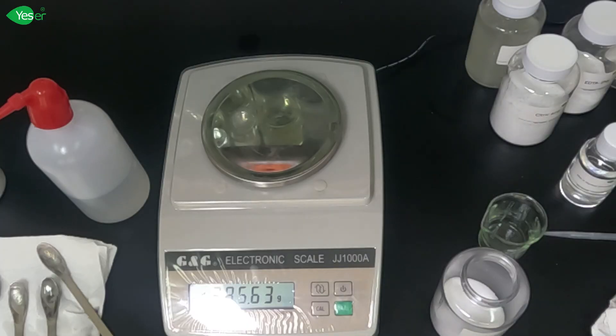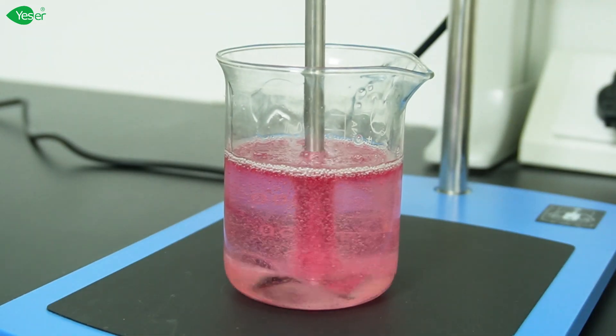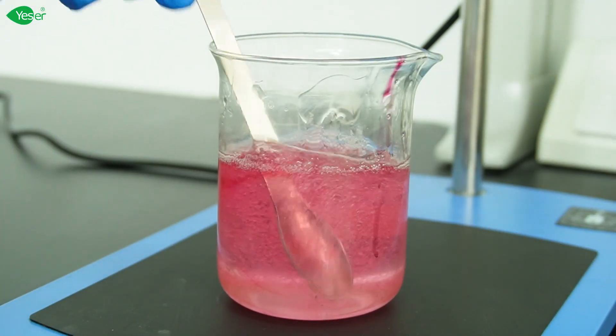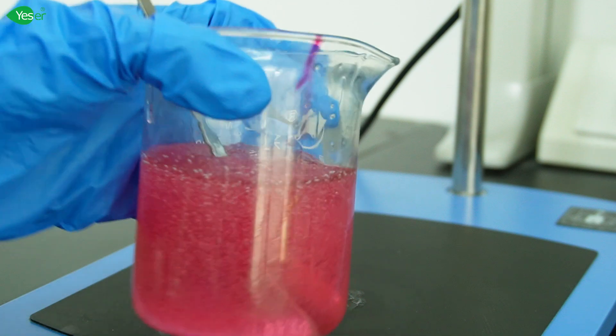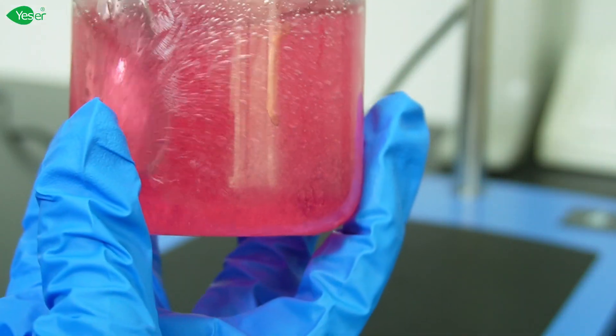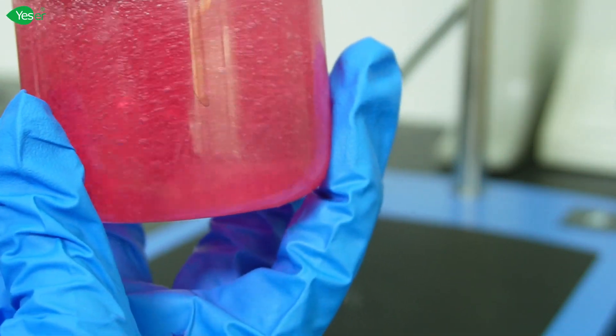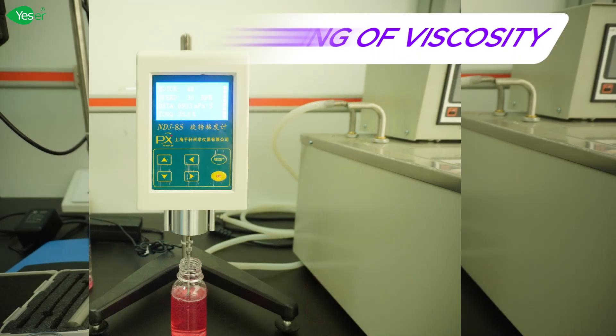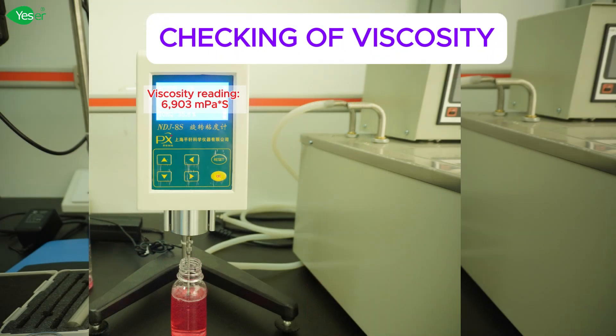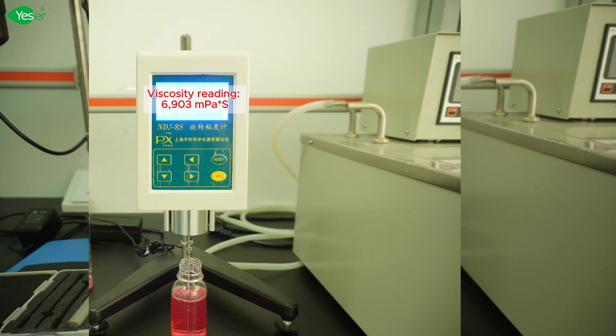Now we can add our dye for our formula. And now our transparent moisturizing body wash is finished. Now that we have finished our formulation and have cooled it down, we check our viscosity and it reaches 6900 millipascals.